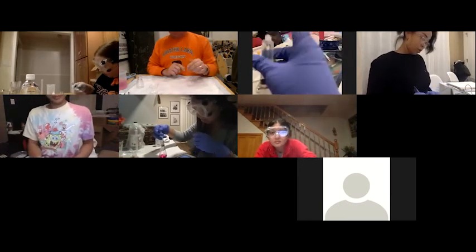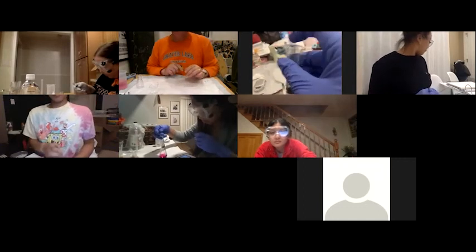I don't know if you want me to move it all the way to the top over here, or if it's enough to be right here. Oh, the top. Well, you're going to be filling it from the bottom. You put the syringe in like this and you draw it up. So there should be liquid in there. Right, it is. Okay. I just wasn't sure, in terms of getting the amount of air, if you wanted the liquid all the way to the top here, or if it was enough for the liquid to just stay at this point.